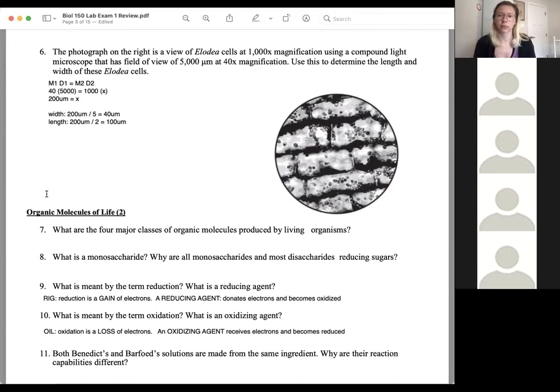So do you have to add a percentage for the diameter? For example, in this case, the length of 100 is going to be 50% of a diameter. Do you have to add that on the test, or is this enough? This is enough. Both of these answers we got using the counting method, but what you're referring to is that other method called the percentage method.